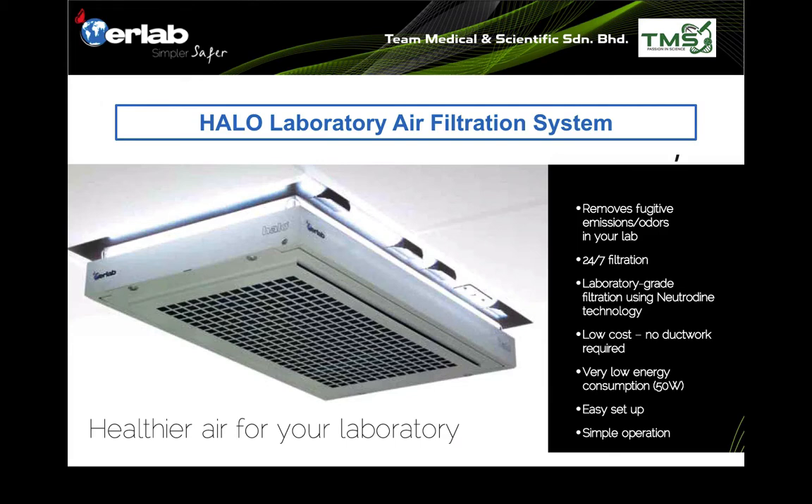Harlow is low cost because it's not linked to ductwork — there's no ductwork required. It has very low energy consumption, just 50 watts, which is actually lower than a typical lamp used in your house. It's easy to set up and simple to operate.